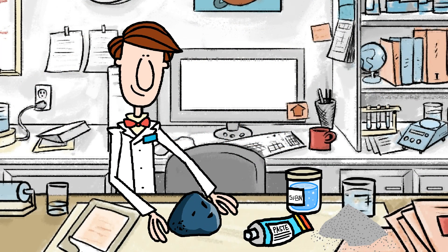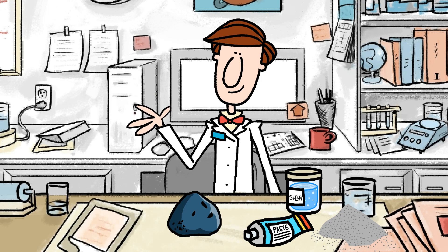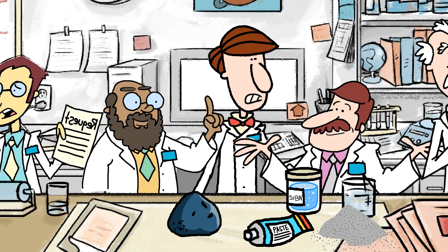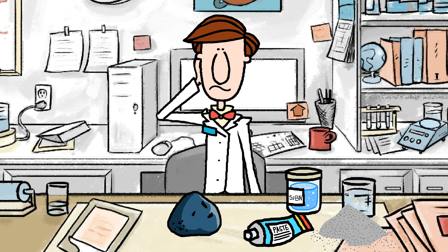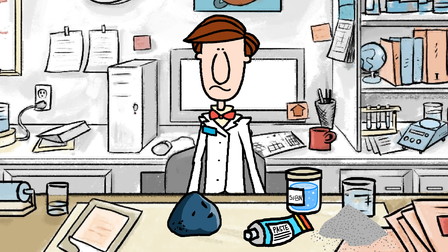At the XYZ company, Mr. Scientist is in charge of the thermal analysis lab. His colleagues need thermal conductivity data for their latest batch of formulations, and he'll need to pull on a complete toolkit of capabilities. Knowing what technique to use makes all the difference to completing the job right and on time.